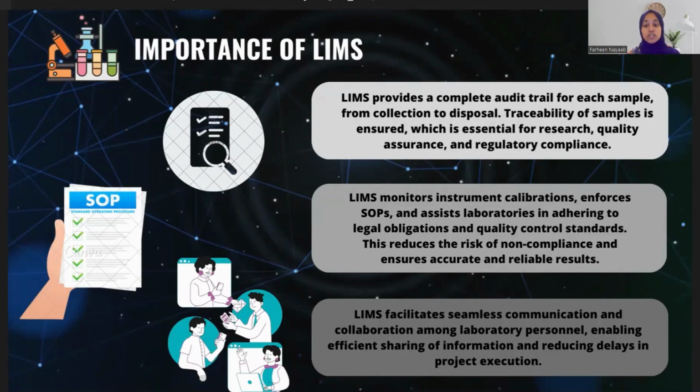Now, LIMS monitors instrument calibrations, enforces SOPs, standard operating procedures, and assists laboratories in adhering to legal obligations and quality control standards. This reduces the risk of non-compliance and ensures accurate and reliable results. And LIMS lastly facilitates seamless communication and collaboration among different laboratory personnel, enabling efficient sharing of information and reducing any delays in project execution or in the processes that occur within a laboratory in order to ensure efficient patient care.